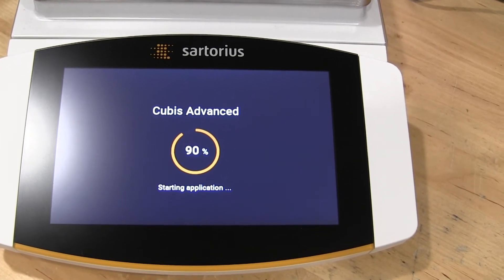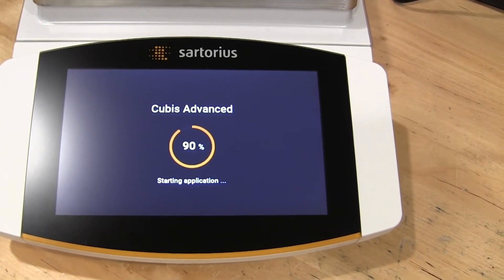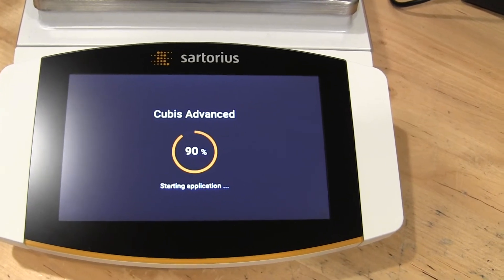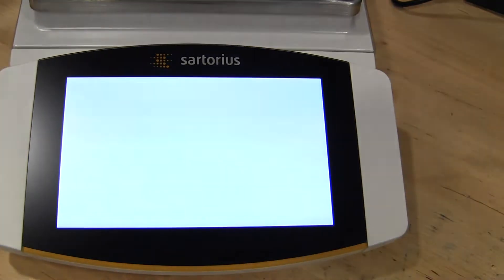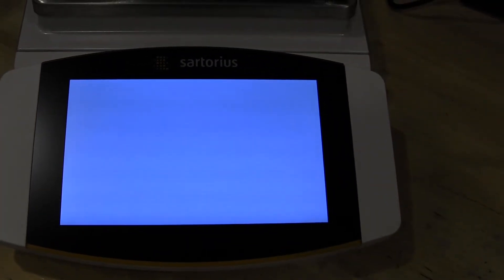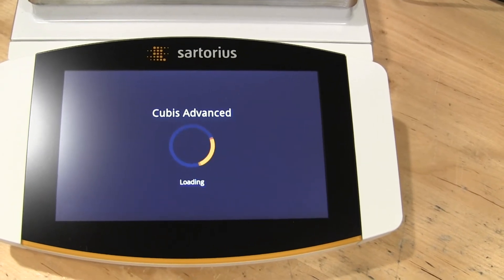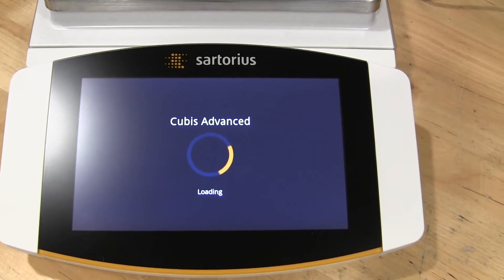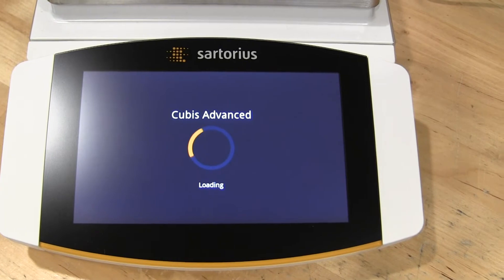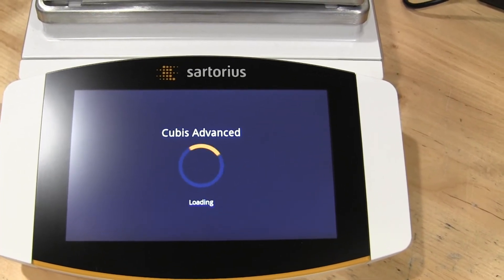It's a pretty complicated balance even going through the manual. I have a lot of experience with balances and it took me several hours to really figure out how to set it up for my weigh-in application. Sartorius does offer a service where they'll come on site and do an IQ/OQ — that's all an additional cost. This really isn't a balance you want to buy, get delivered, and set up on your own unless you have a lot of experience, especially with the Sartorius line.